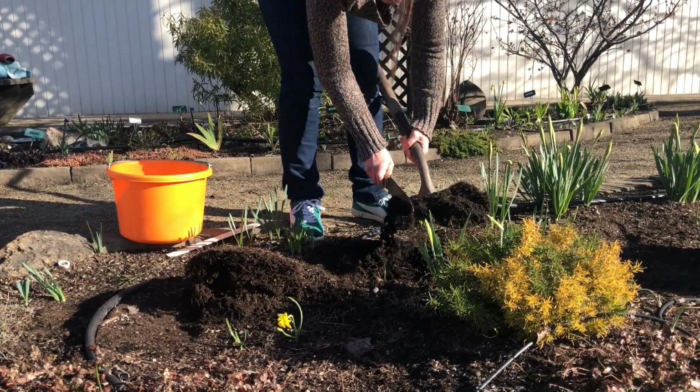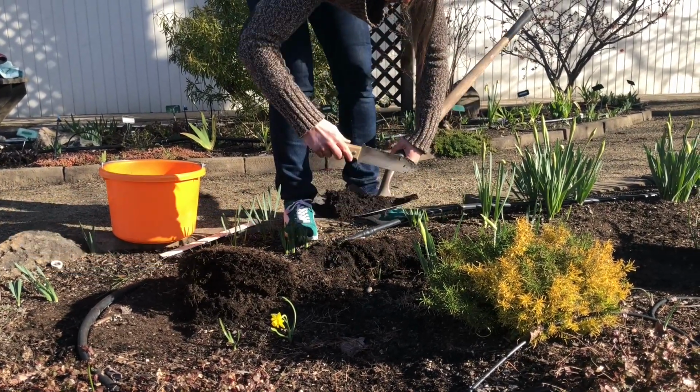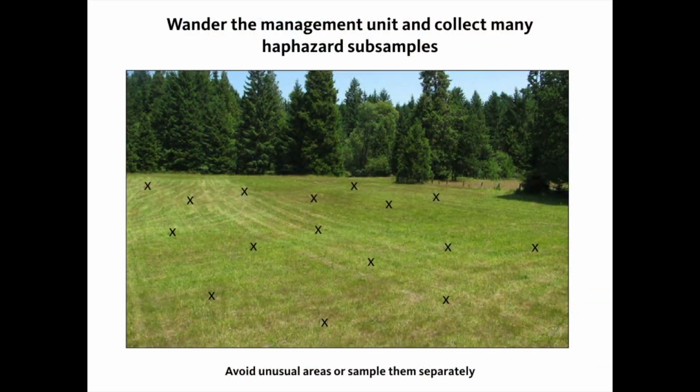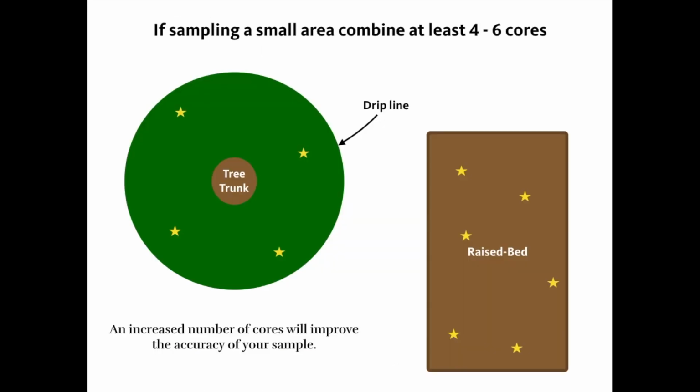Here we are removing excess from the edges of the sample because we will collect 3 or 4 more of these per garden bed and do not need to overfill our bucket. In large areas such as lawns or pastures, we need to take 15 to 20 samples, which is more accurate and easier to do with a corer versus a shovel. In smaller areas, such as around trees or garden beds, only 4 to 6 samples are necessary.